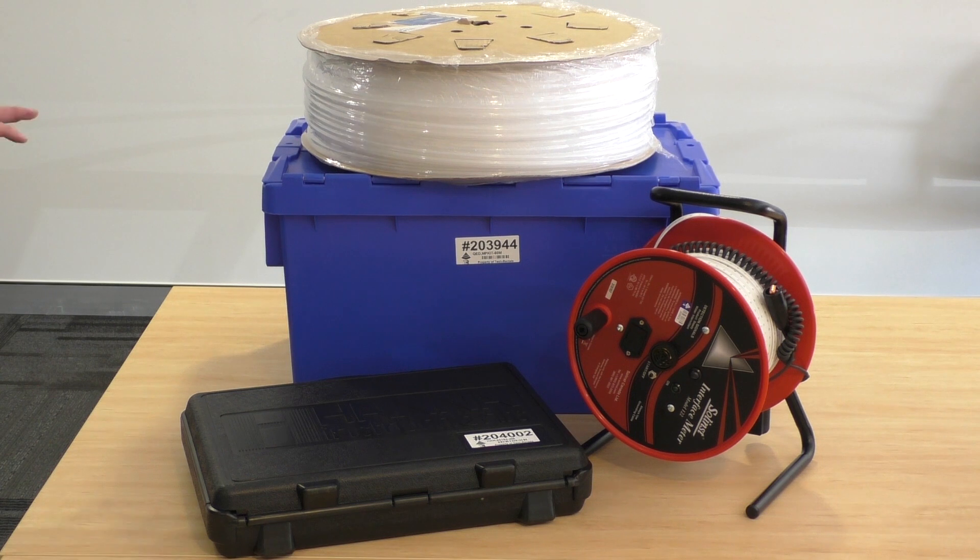So along with the QED Micro Purge kit, Tech Rentals can supply water quality meters, interface meters, and consumables like your twin tube and the bladders. All together we can provide the full low flow groundwater sampling solution.